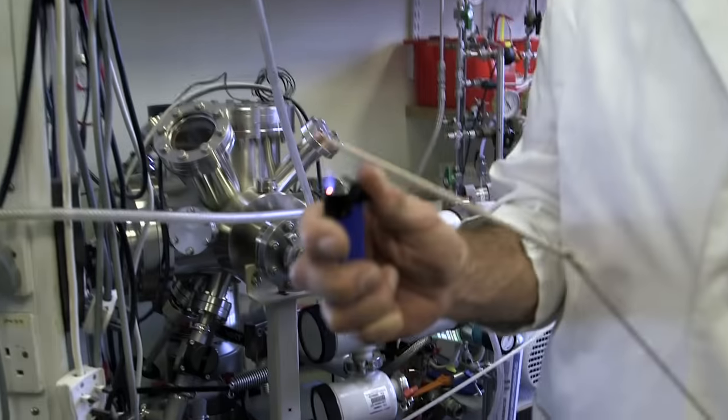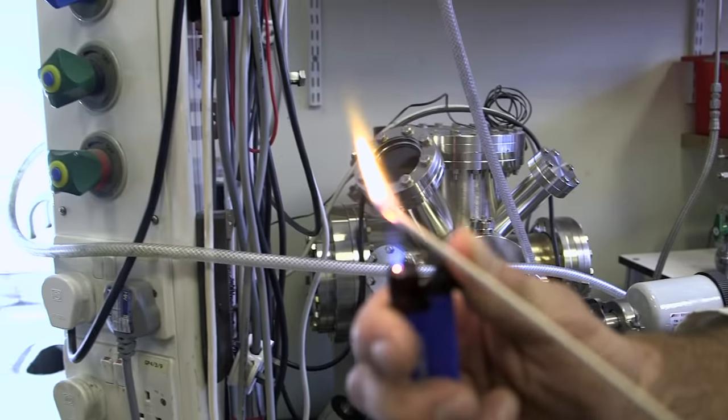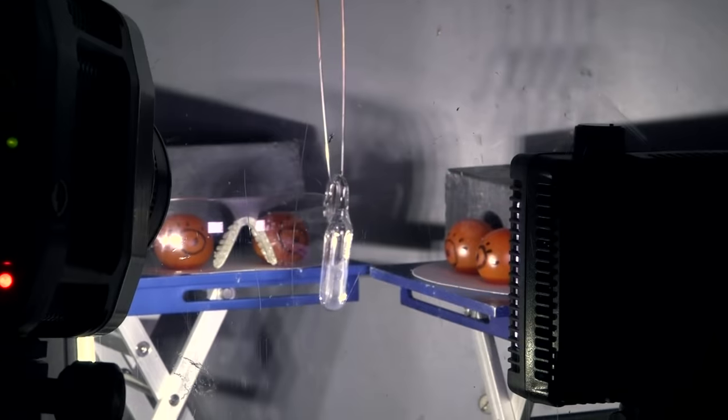The third tube was an enormous explosion. Really, even Neil, our gallant technician, was a bit shaken.